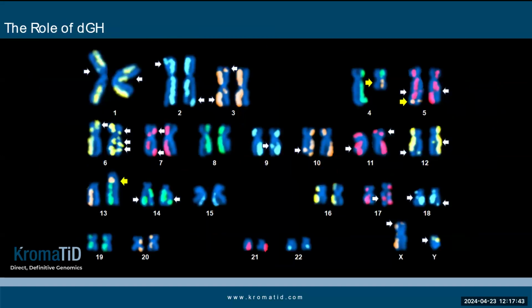Here's a screen image we saw earlier. If SKY alone were used, only the 3 rearrangements indicated by yellow arrows would be detected. Being based on FISH and labeling both strands at once, rearrangements that don't change chromosome size, number, or arm length will go unnoticed by SKY.